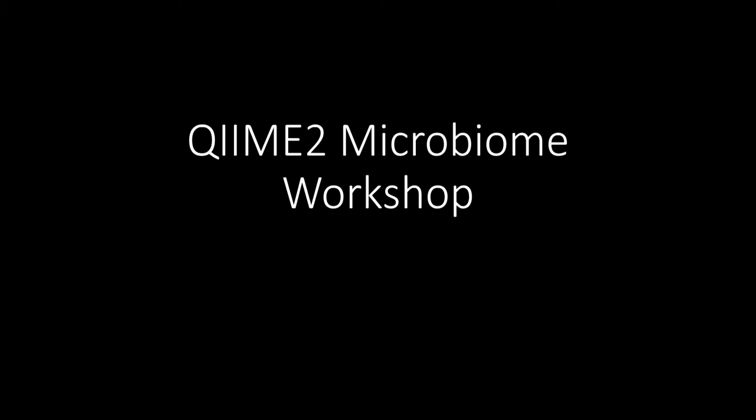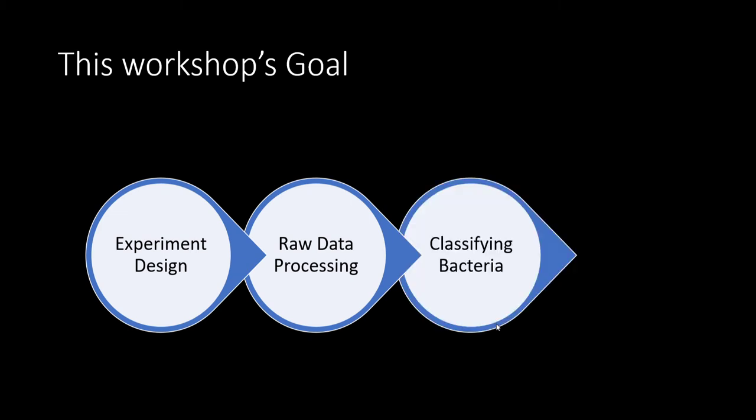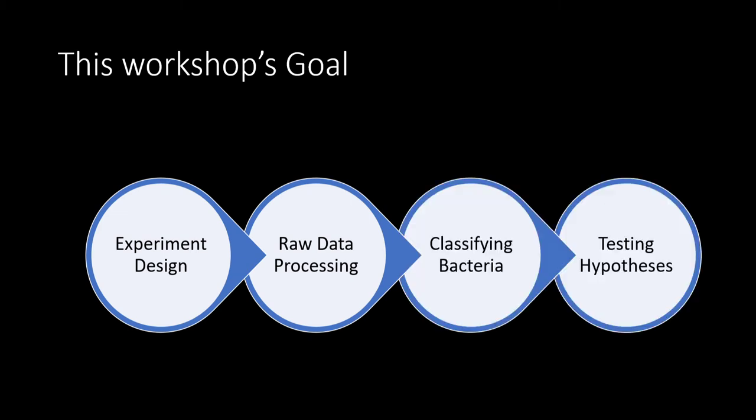So the goal of the QIIME2 microbiome workshop is to teach us all how to design a proper microbiome experiment, how to go through the raw data processing steps, and how you could save money by not having the sequencing agency do that, classifying bacteria to different taxonomic orders, and then finally being able to do some of our statistical tests to see if our hypotheses hold up.